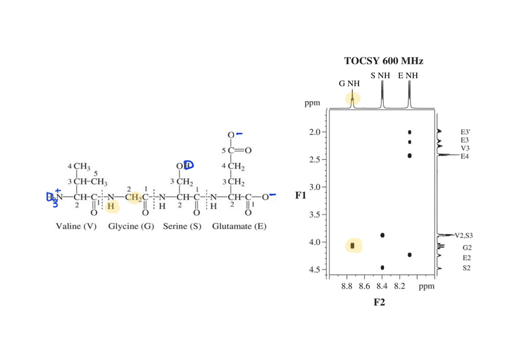For serine, the NH we've already established by COSY was linked to a peak at 4.5 parts per million, which is further linked to a 2H multiplet that is attached to a heteroatom at 3.8 parts per million. This happens to overlay with another 1H group, but ultimately it can be determined that there is this correlation for an amino acid that fits the structure of serine.